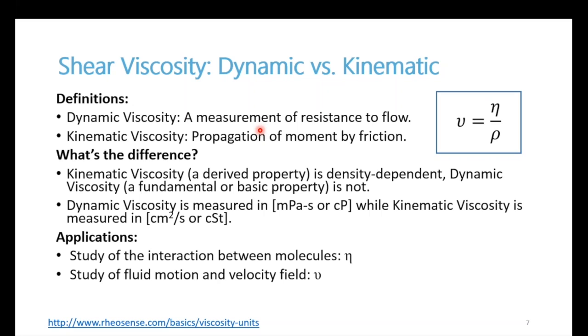So if you want to look at applications that look at the interactions between molecules, the force or the energy required to exert some kind of flow or subject some sample to some specific flow, then you're probably going to be looking at dynamic viscosity. If you're just interested in the fluid motion and the velocity field, as in the Navier-Stokes equations, then you will probably be using kinematic viscosity.